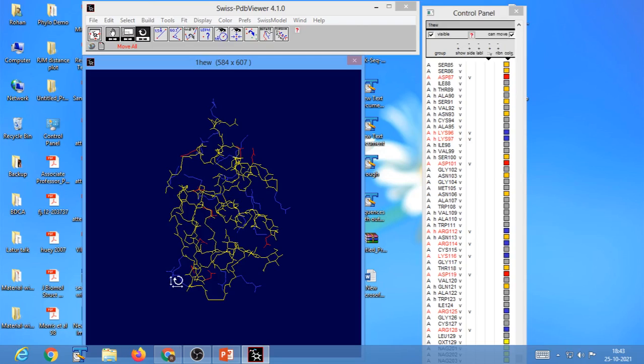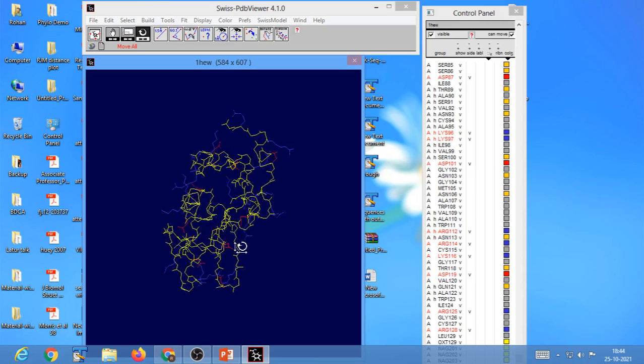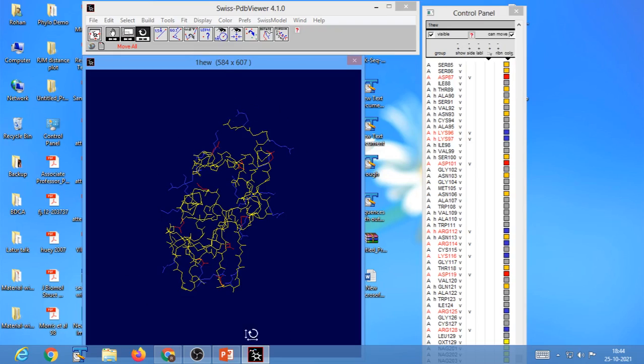That is what I wanted to show you in this representation: your protein is said to be folded correctly when all or most of the hydrophobic amino acid residues are generally oriented toward the core of your protein, and charged residues like acidic and basic residues, or even polar amino acid residues, have their side chains oriented on the surface of your protein so that they can interact with the surrounding water molecules, in order to make your protein molecule thermodynamically very stable. So this is what you have learned so far by simply coloring your protein molecule with different coloring schemes.